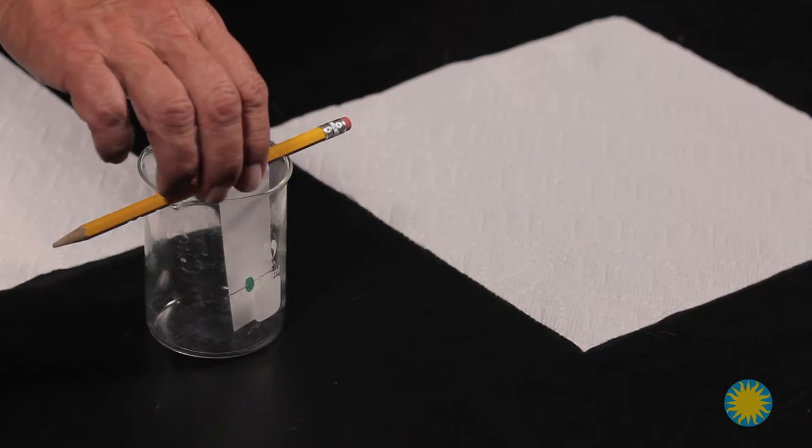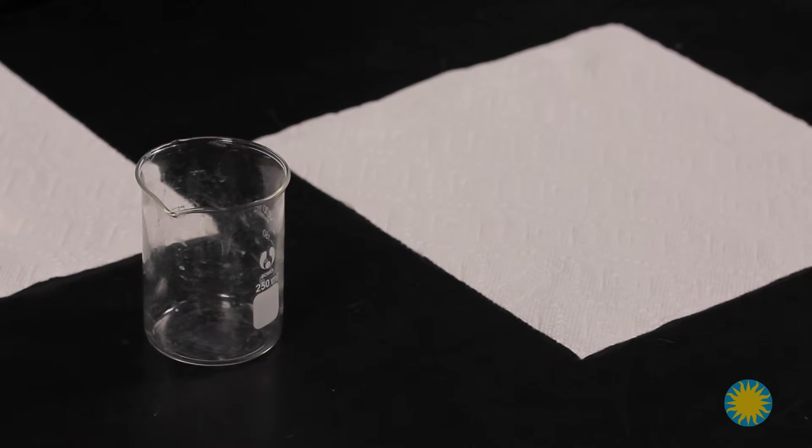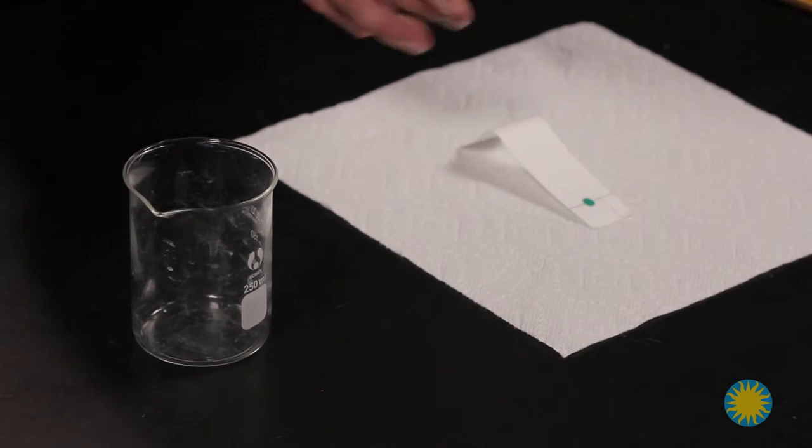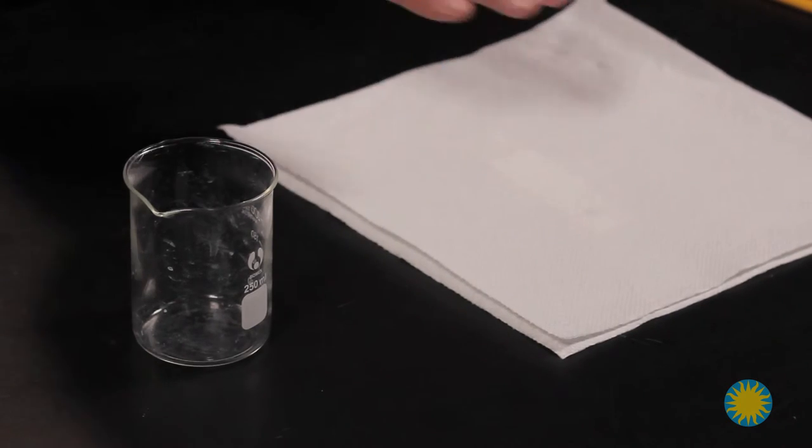In Lesson 4, Drying the Chromatography Paper, have the students take the paper out of the beaker and place it between two paper towels. Sometimes, have the students take the two paper towels and place it in their notebook to help the paper dry quicker. Sometimes, you can simply leave the paper towels out on the table and it will dry also.